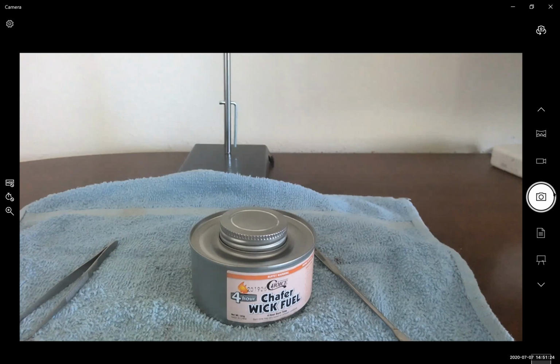They will promote to a higher energy level. And when the electrons relax down to the ground state, light will be released. The exact color of light depends on the relative energy of the energy levels for that element and the relative energy of the electron transition. Based on the energy of the electron transition, a photon with a discrete energy is released, and in turn, we see a different wavelength or color of light. So we'll be able to see a distinct relationship between an element's identity and the wavelength or color of light released during emission from a flame test.